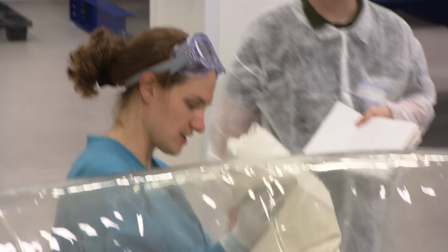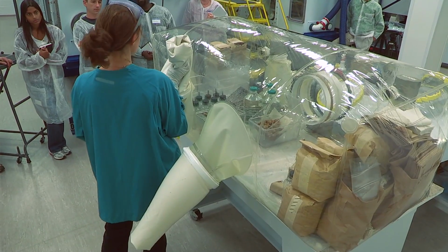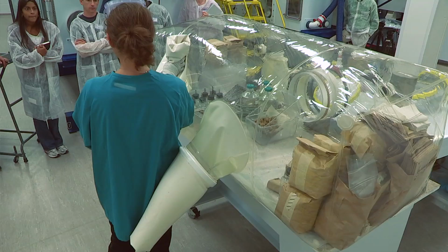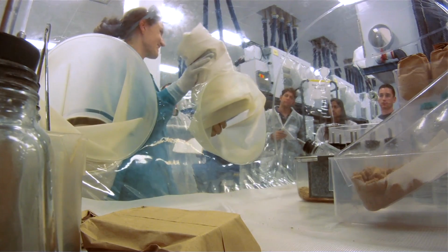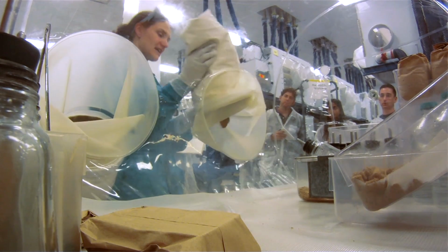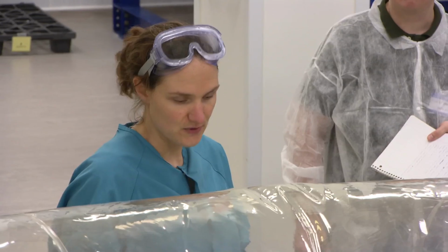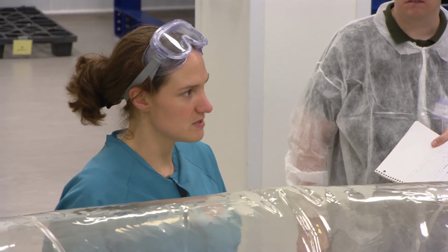Or under here where this ring is and the bedding gets stuck, a lot of times the bedding will poke through here. So on this one we reinforced with some pool patches. We just said, you know what, just in case, we're putting some pool patches on there, and then we retaped over with some of the white tape around. Seams, what we normally do if we find a hole is pool patch, and then reinforce with the yellow tape.